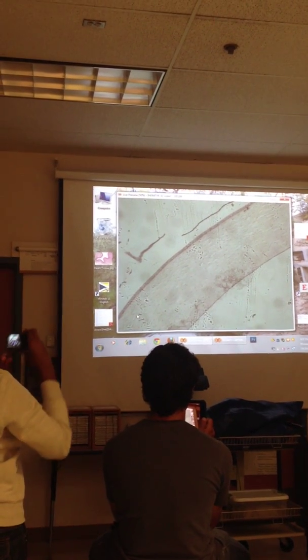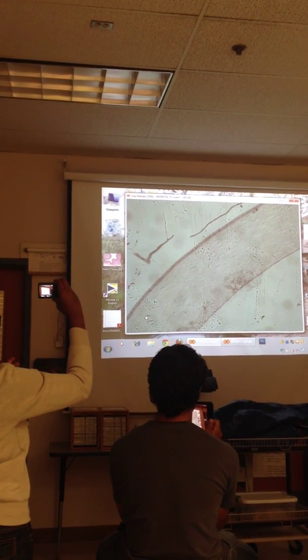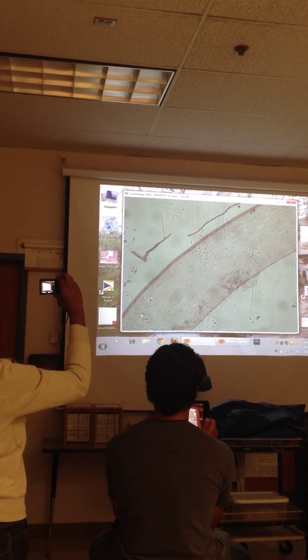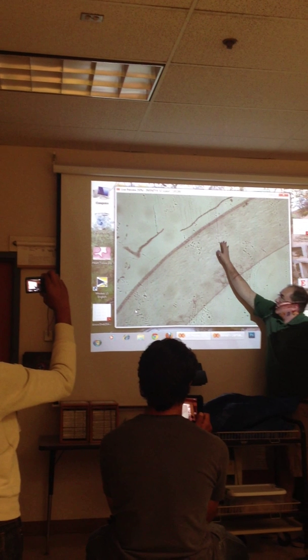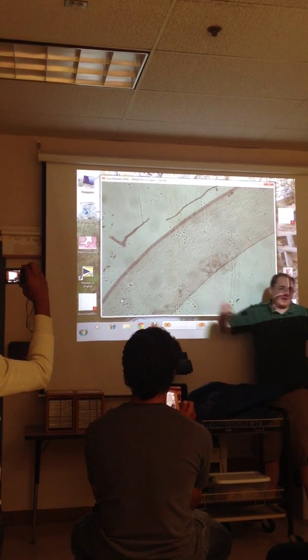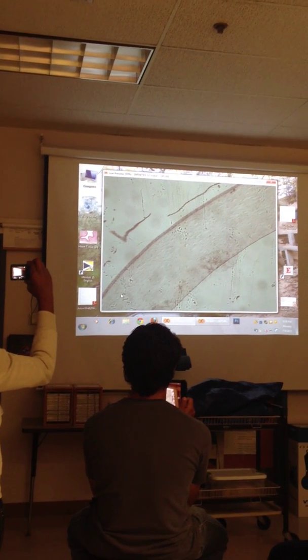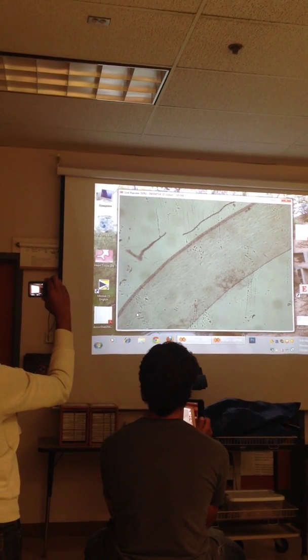So what you're looking at right now is the front of your eye where the contact lens goes. What is that? Cornea. So it looks like a bunch of dense, regular connective tissue throughout here. And then you see this epithelial layer lining it on the anterior, the superficial anterior surface there.